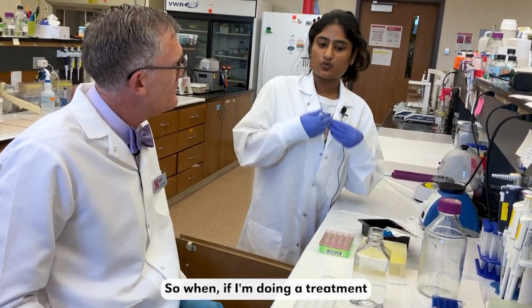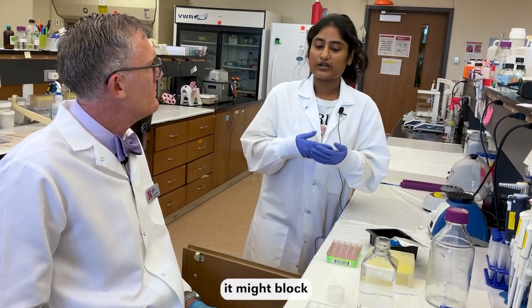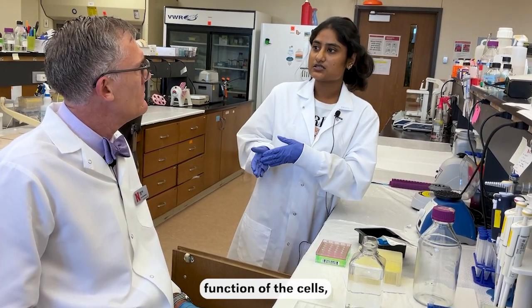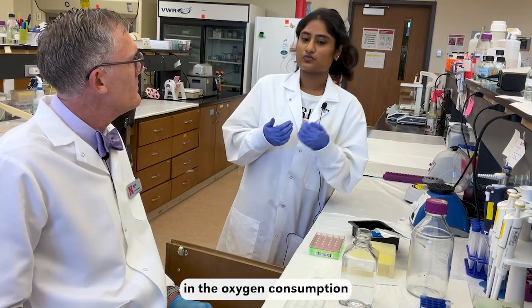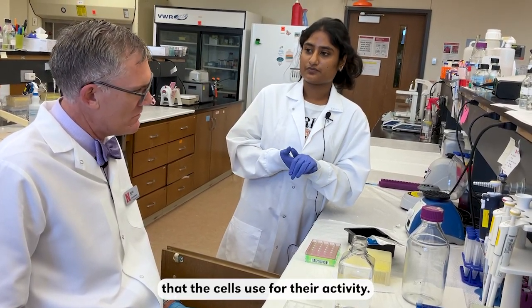So if I'm doing a treatment with some fatty acid, it might block the actual mitochondrial function of the cells, which will result in a decrease in the oxygen consumption that the cells use for their activity.